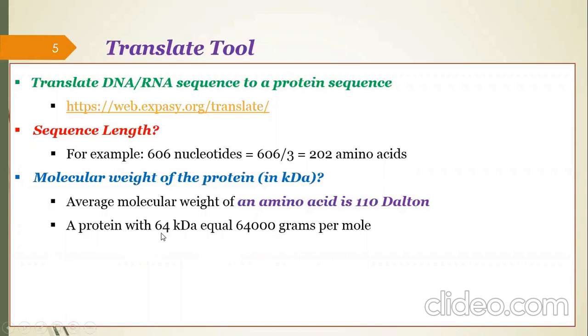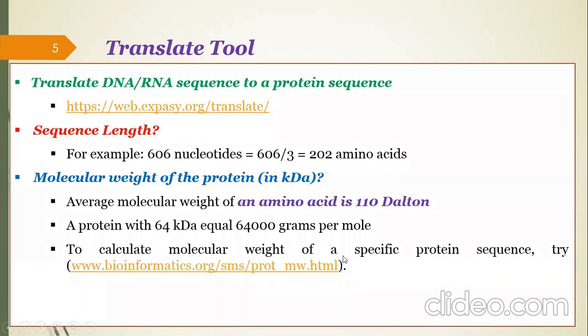To calculate the molecular weight of a specific protein, try this sequence. So please, Noreen, check this site, and we will check this later.